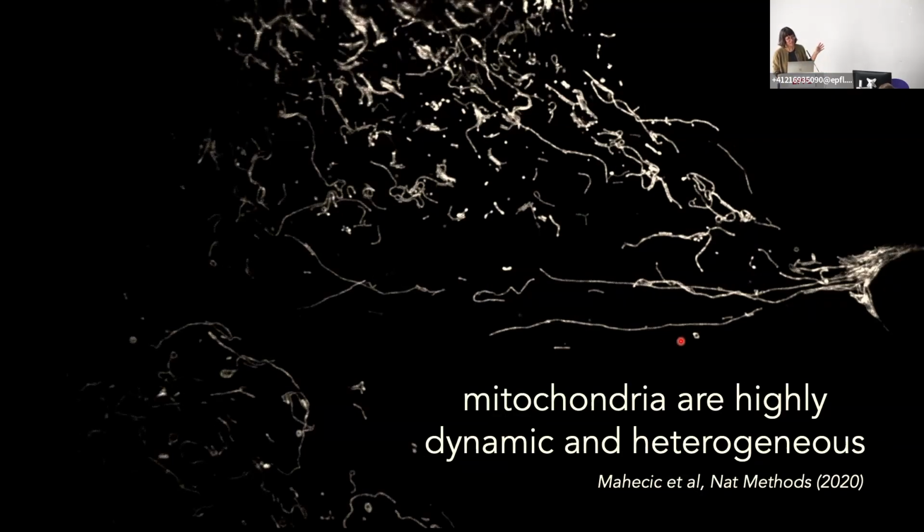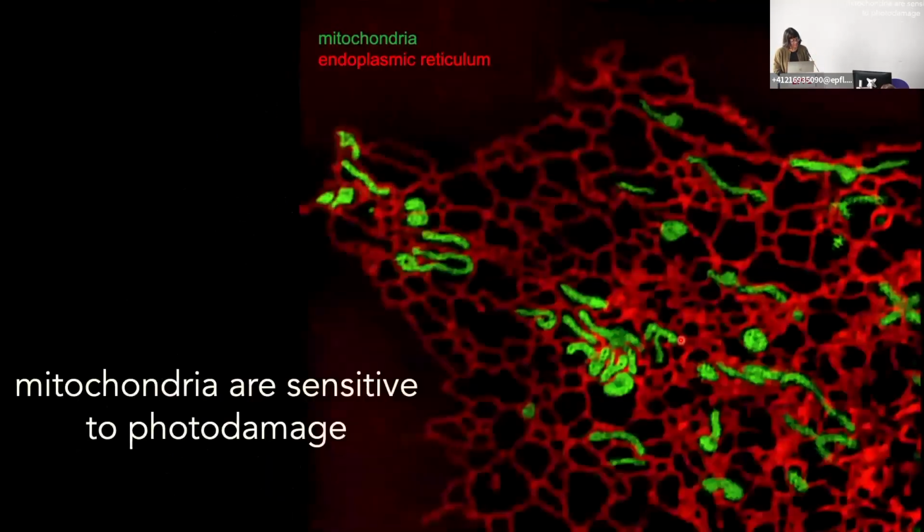Trying to catch these different parts of this life cycle in this very heterogeneous and dynamic system, where the DNA replication and division are highly asynchronous compared to our own cell cycle, is a difficult problem of event detection that we're up against. It is highly dynamic and heterogeneous, but also very sensitive to photo damage.